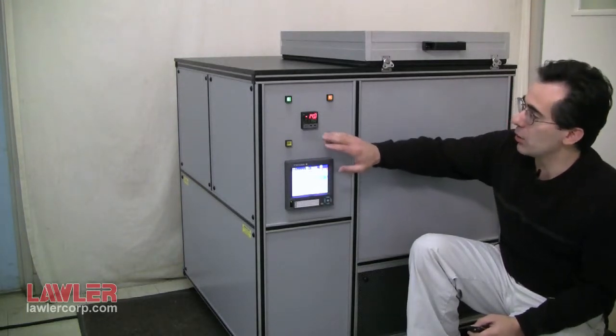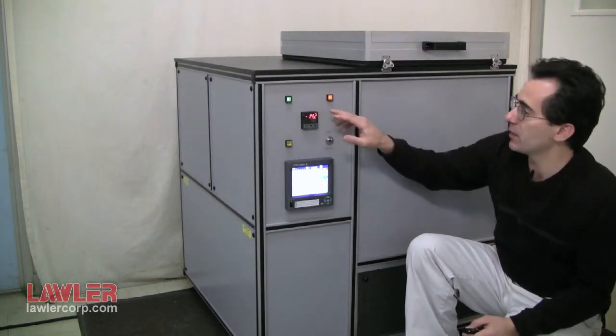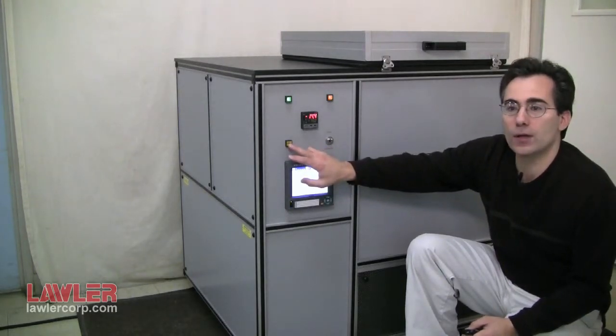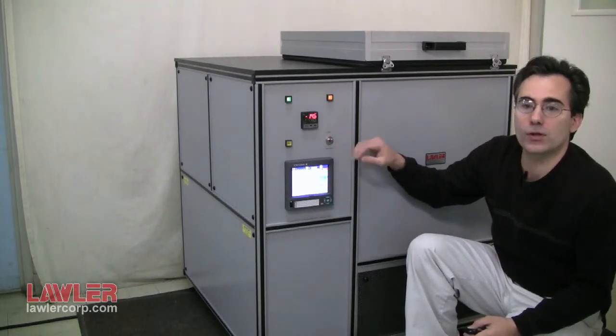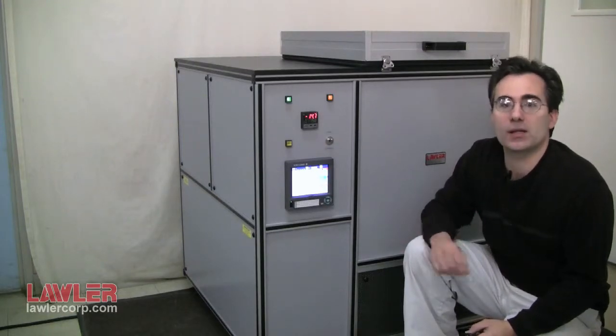There's also a series of buttons here. You have the main power for the instrument, the blower on and off, and this button is for turning on the torque motor. This selector switch is for forward and reverse of the motor to put the tension and compression, depending on the test method.